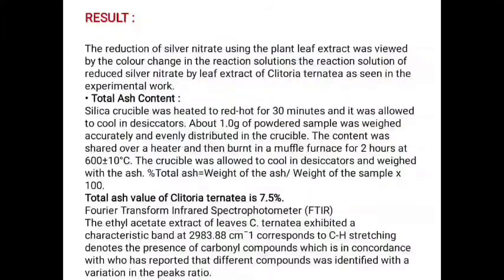So next is the result. The reduction of silver nitrate using the plant leaf extract was viewed by the color change in the reaction solution. The reaction solution of the reduced silver nitrate by leaf extract of Clitoria ternatea as seen in the experimental work.